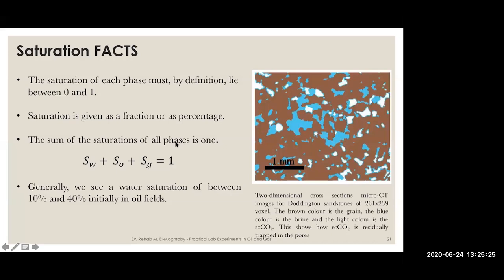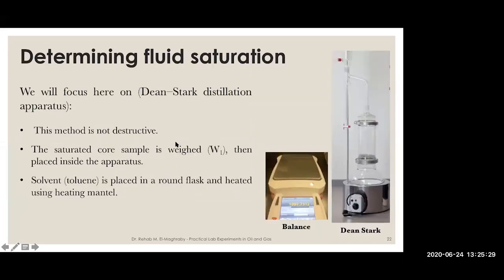How to measure the amount of oil saturation, the amount of water saturation inside a core plug that was taken from the oil field, or whatever place that you have your core coming from? So we use this called Dean-Stark distillation apparatus. So the Dean-Stark apparatus is used mainly to measure the water saturation.